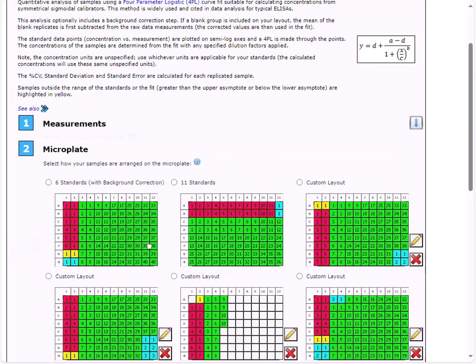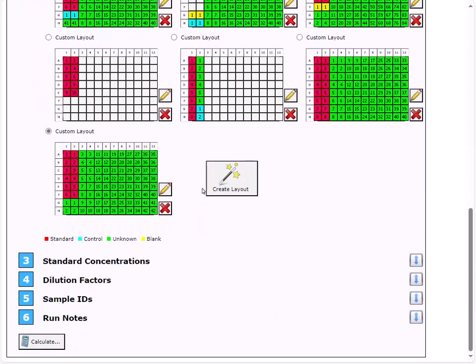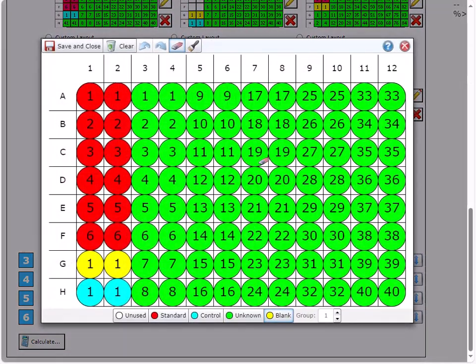Next, I'll specify the plate layout. If the layout I'd like to use exists, we can make that selection, but for my assay, the plate does not include a blank or a control sample, so I'll select to create a new layout and use the plate layout editor to specify the layout.